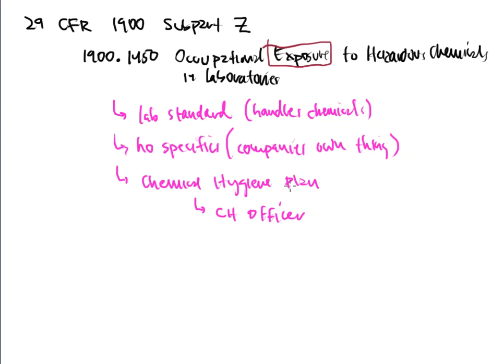And that chemical hygiene officer is also responsible for training or implementing a training program for the new employees that might come through the company. Now, all of these are OSHA requirements. They are legal, right? They're in the Code of Federal Regulations. Laboratories have to follow them. We have to reference them whenever we can. And these are certain subparts that are going to be pretty important, okay?